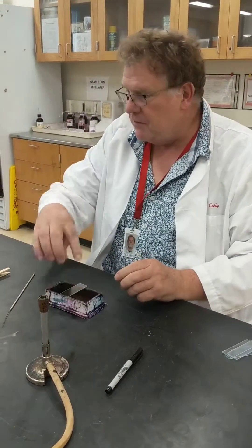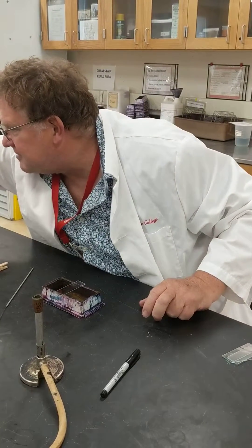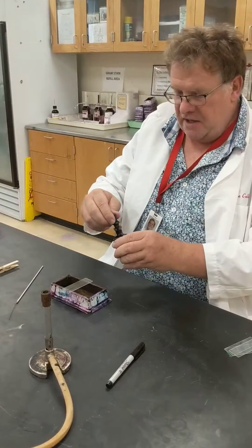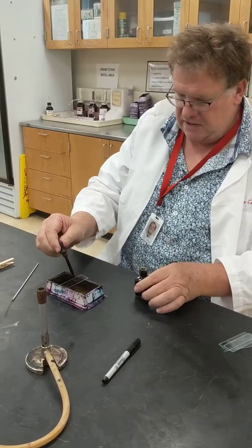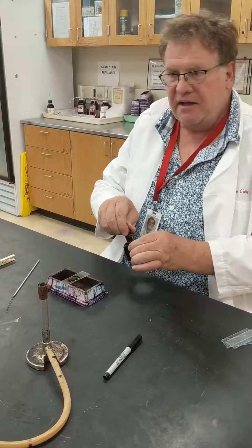For our stain, what we want to do is grab a stain. For the simple stain you can grab almost any one, but I really like using crystal violet. So what you will do is flood the slide with the crystal violet.